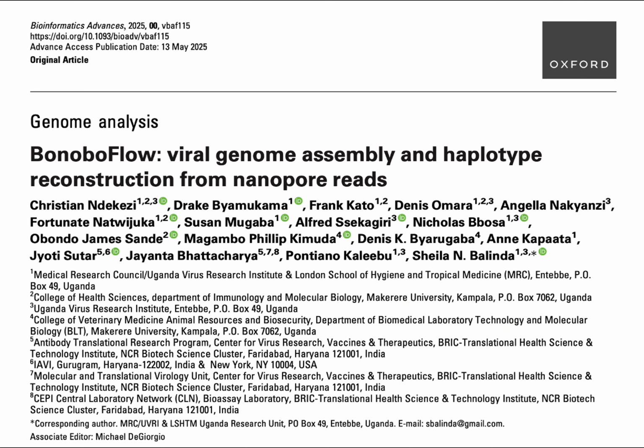Right. If you give it the raw POD5 files, the first step is base calling. It uses a state-of-the-art tool called Dorado with a super high accurate, or SUP model. This translates those faint electrical signals into clear, readable DNA sequences. Like decoding a secret message into plain text. Kind of, yeah. Then, once you have clear sequences, it's all about cleaning and sorting. Right, prepping the ingredients. First, it uses a tool called Chopper. This trims off any unwanted adapter sequences, little bits of DNA added during the lab prep. Think of it as trimming the excess dough off your cake.